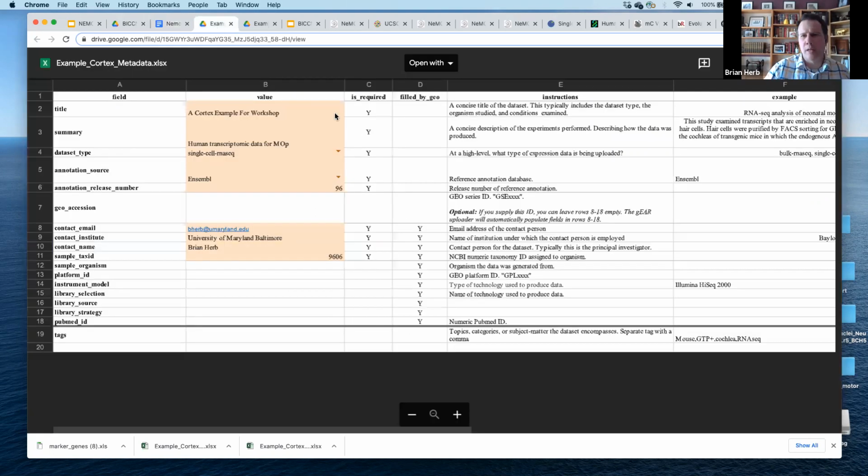As you're downloading that, I'm going to walk you through the files that are needed. So first off, this is the metadata file. You can certainly borrow this, put in your own values. The only thing we really need are the values in beige here. So a title, again, this is going to be a dummy data set.